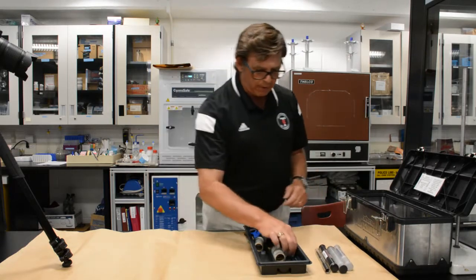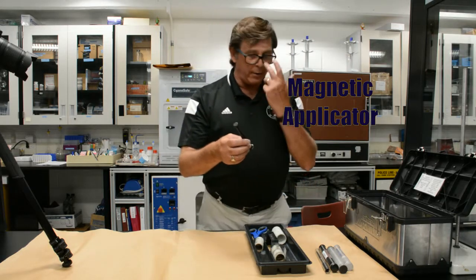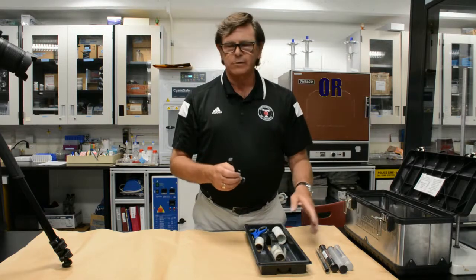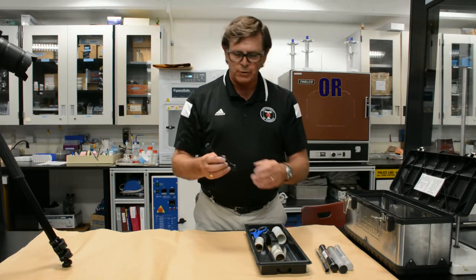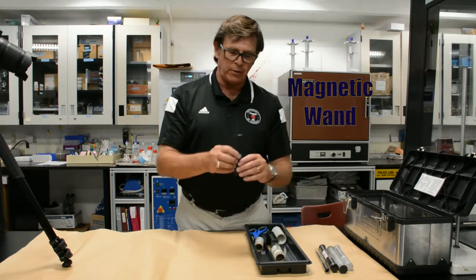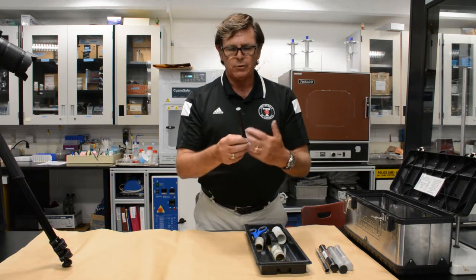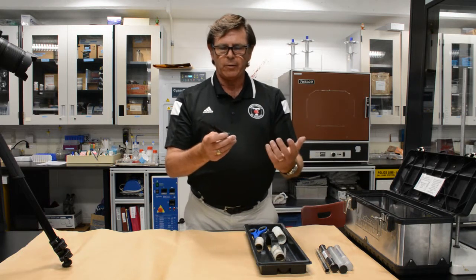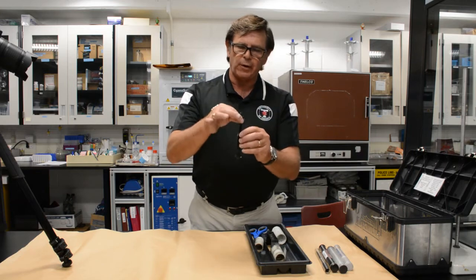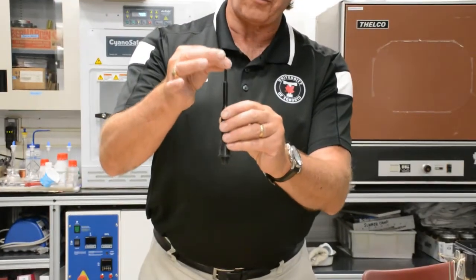Next on the list is a magnetic applicator. The magnetic applicator is an alternative tool. Instead of using granular fingerprint powder with a fiberglass filament brush, this uses magnetic powder to apply the powder onto the surface. These are designed, and some are spring-loaded. You can see that it has a center shaft or a center probe in it.